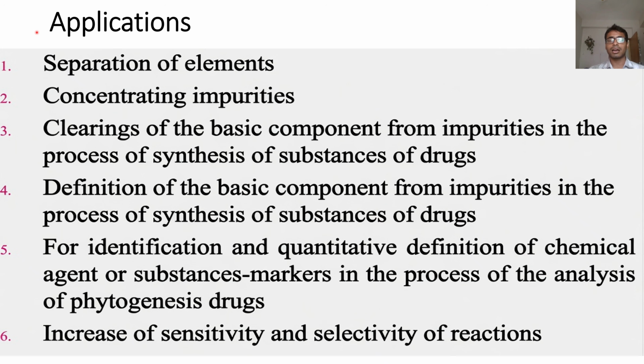So let's discuss the common applications of this method. First of all, separating element concentrated impurities, clearing of the basic components from impurities in the process of synthesis of drug substances, then definition of the basic components from impurities.